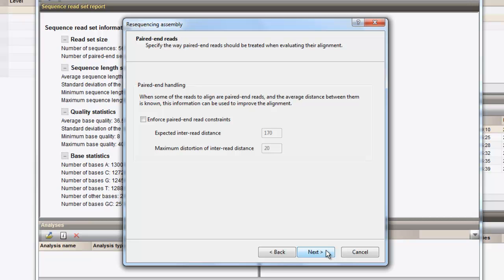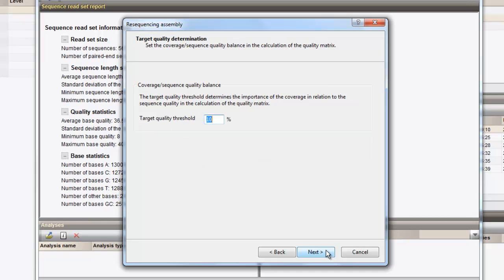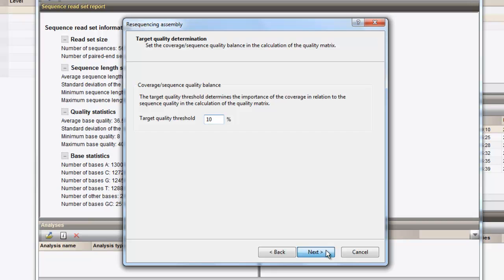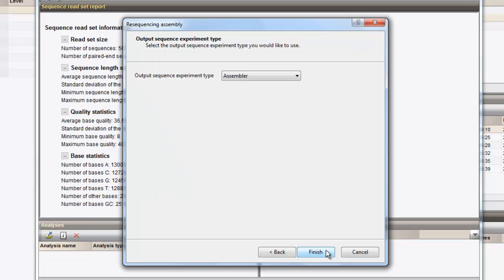We can just proceed, confirm the target quality threshold and confirm the target base callings. The resulting contig will be saved to the same entry. The only thing that needs to be specified here is the sequence type where the assembled sequences should be saved. In this example, we will save the results to the experiment type genome.